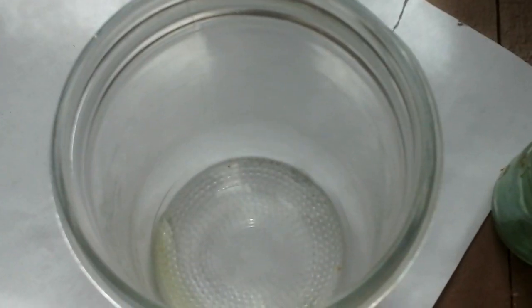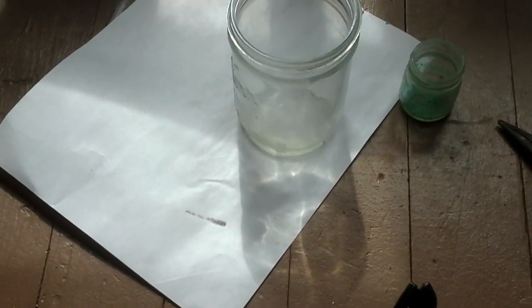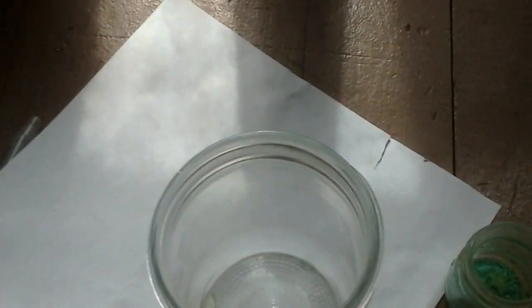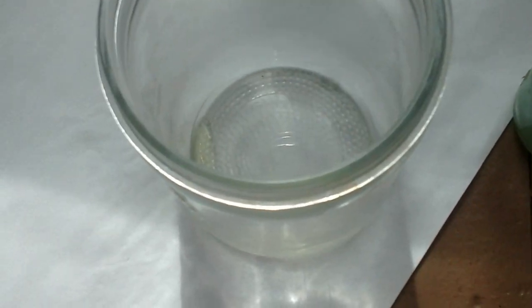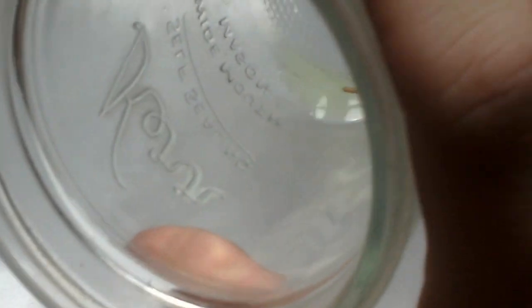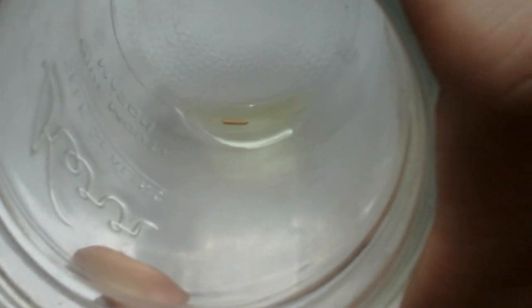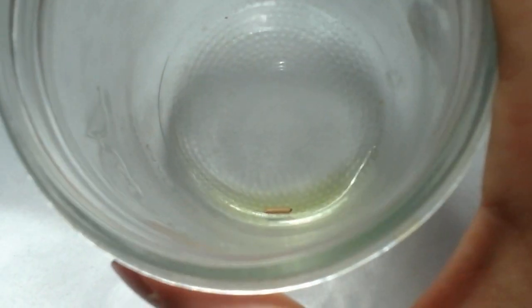Alright, so it's been about two minutes. I found out a way to tell the color — I added a piece of white paper. This HCl was clear. Now look at it. You can actually very clearly see that it's turning green over time. This would indicate copper chloride.